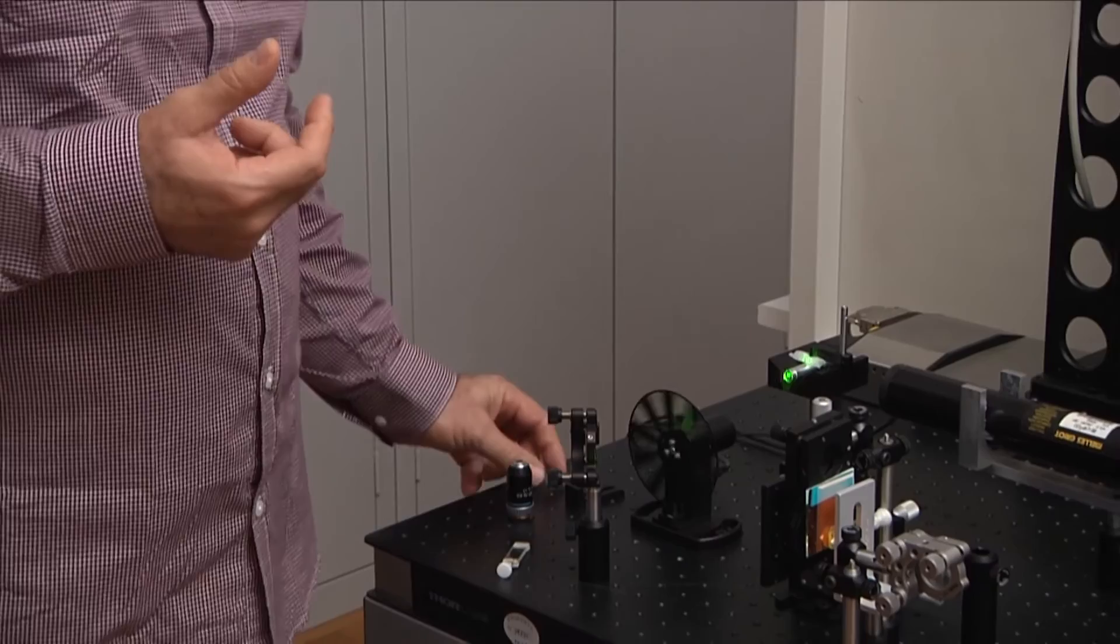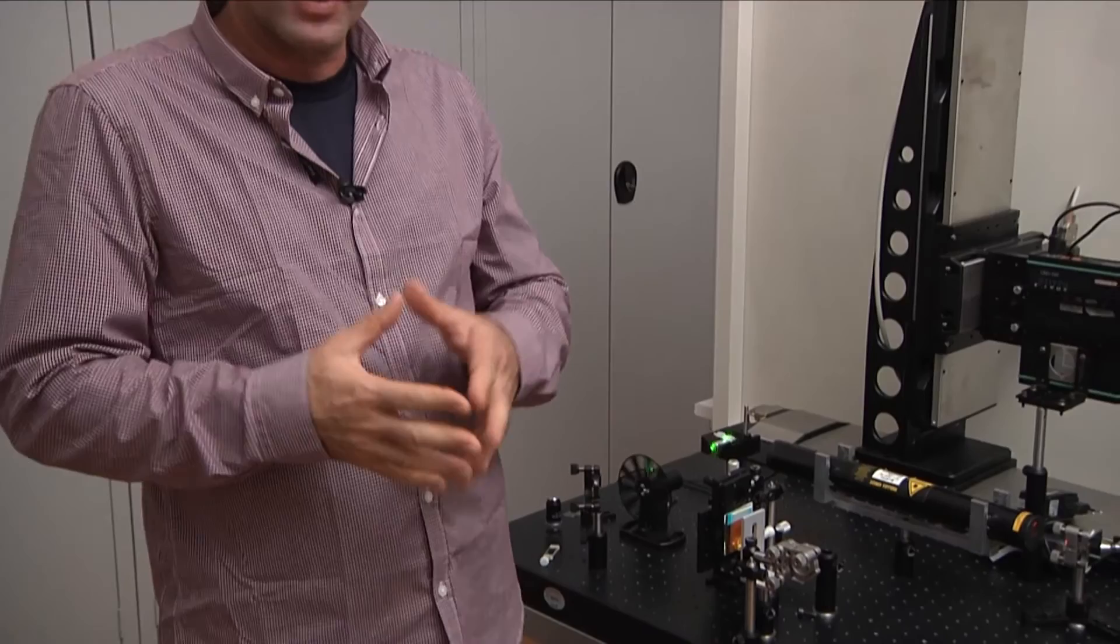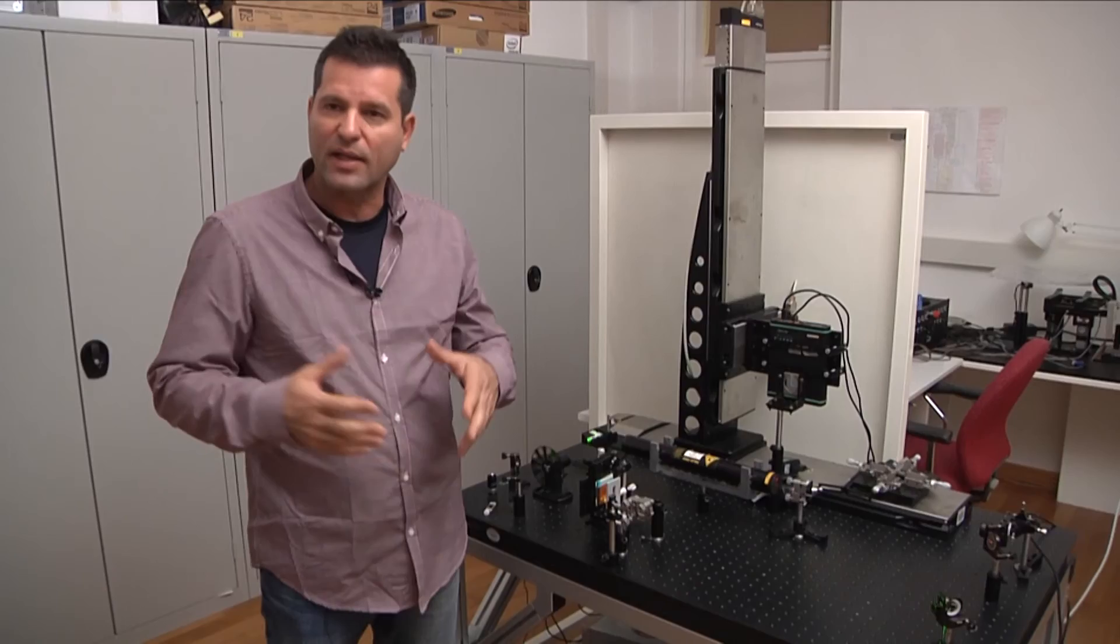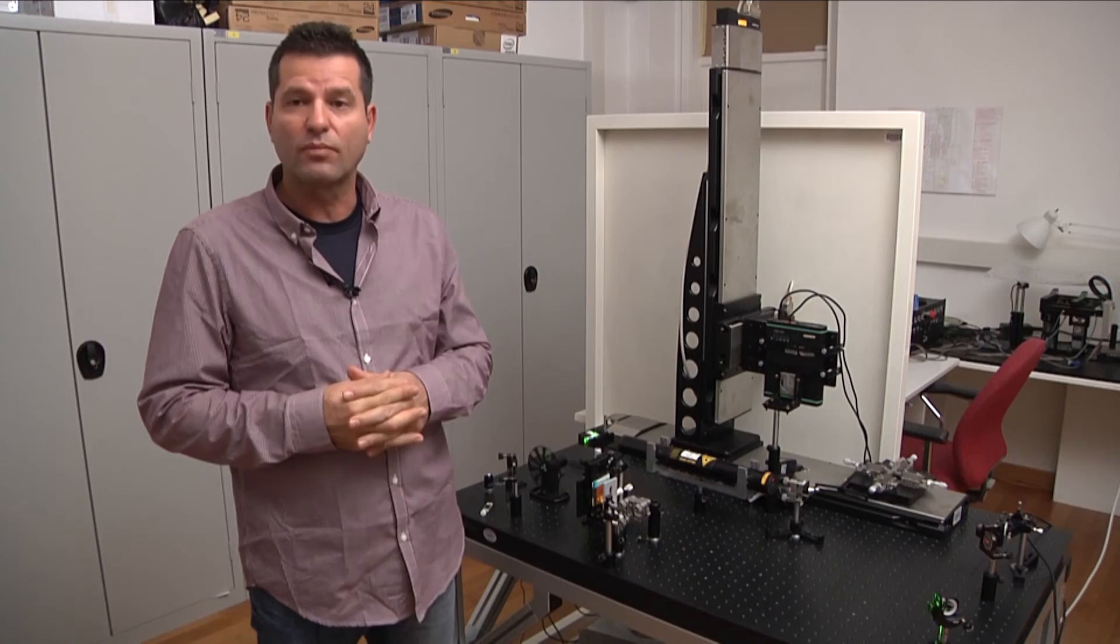And with this setup, students coming to the next Winter College of Optics will be working and doing measurement during afternoon, even using their own samples. Thank you very much for your attention.